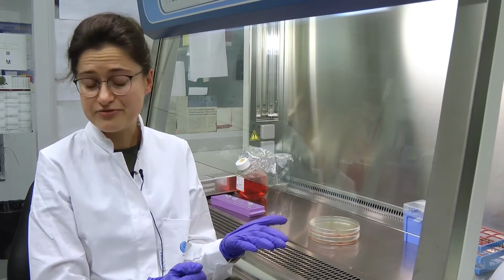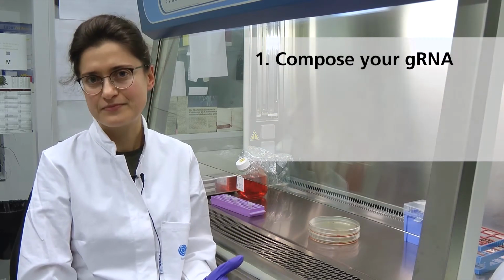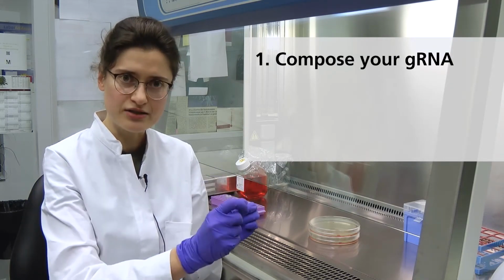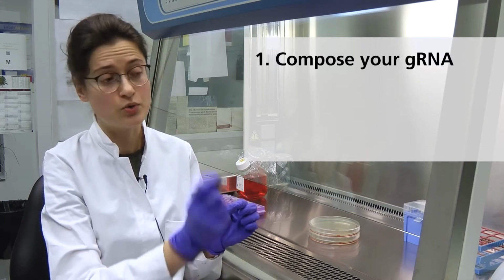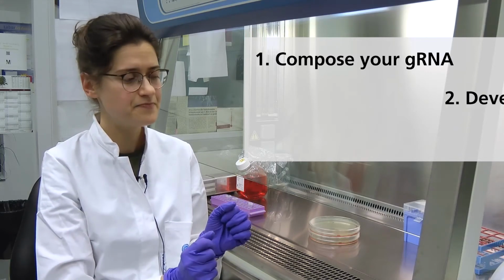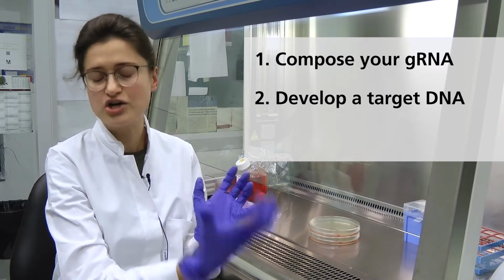And as I explained before, you have to prepare three things. So first you have to compose your gRNA, your guide RNA, and you have to know where exactly in the genome you want to make an insertion and where the Cas9 will be cutting. And there are special programs that help you to do this. All you have to know is where exactly you want to make the cut. Second thing, you have to develop a target DNA.